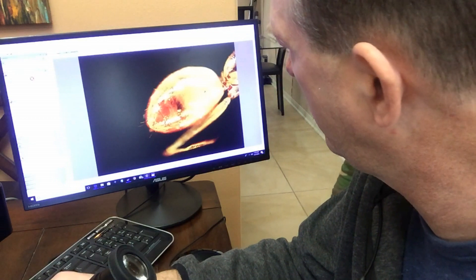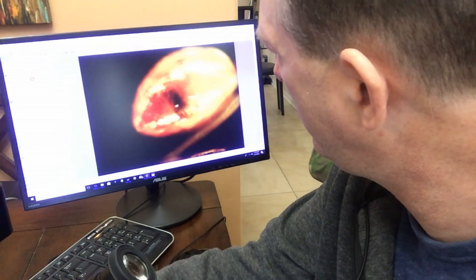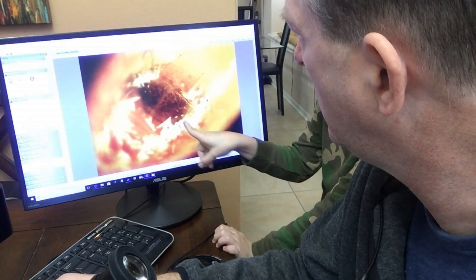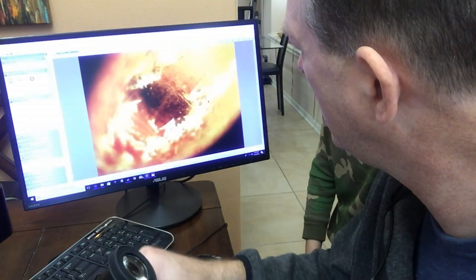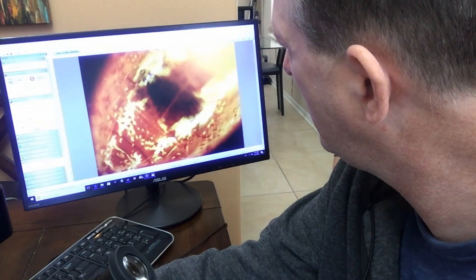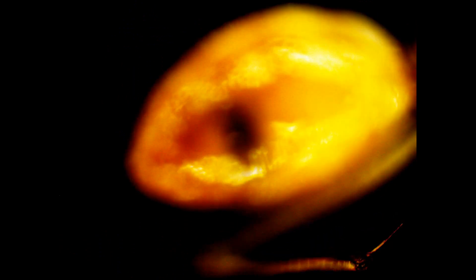Look at this — here we have the bottom of the gaster, and it looks like there's actually food or something inside. I'm not sure what it is. Wow, look at that — it's moving. Is that cool? I don't know what it is, but it's interesting. It's maybe digesting it. That might even be its heart.